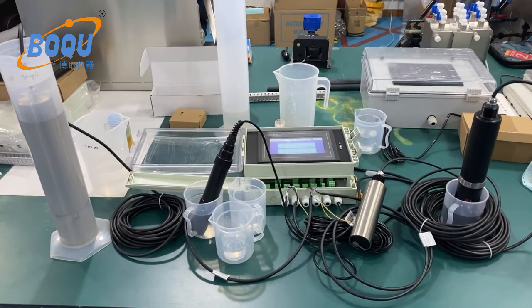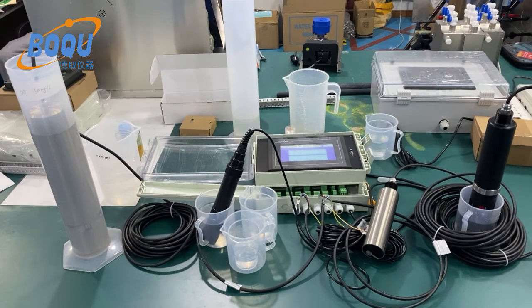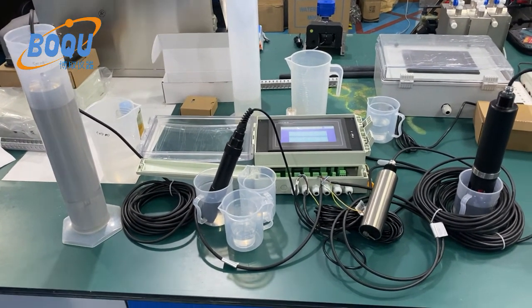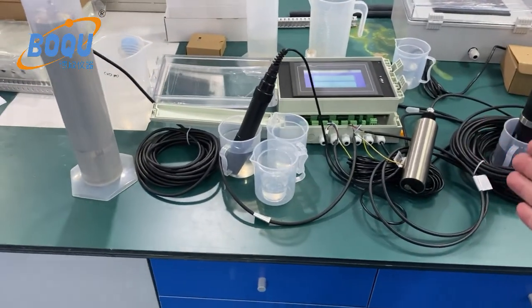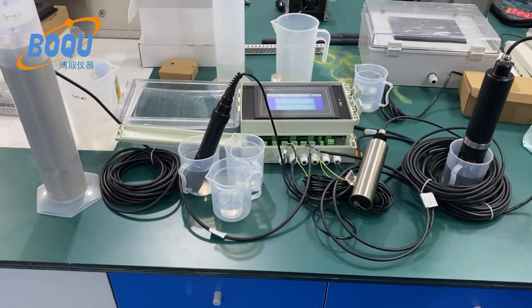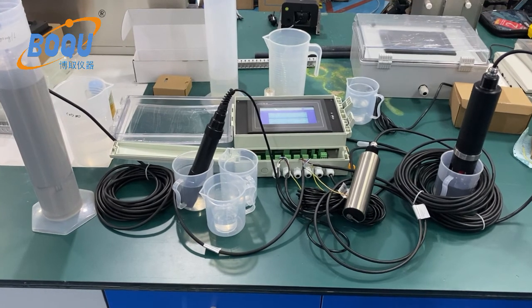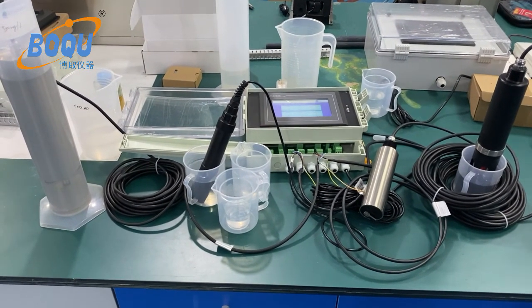Here is the Boku instrument. Now a brief introduction for the multi-parameter water quality meters. The model is MPG6099. This one can measure six different parameters such as BOD, COD, ammonium, suspended solids, pH, and other water quality parameters.